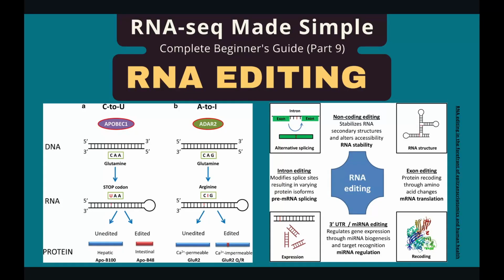In the last video, I showed you how to perform alternative splice analysis. In this video, I'm going to show you how to identify RNA editing events using RNA-seq data. Both processes are post-transcriptional mechanisms that can change protein sequences. However, they differ in mechanisms and effects. Alternative splicing changes the protein sequences by allowing combinations of exons, while RNA editing directly changes RNA sequences.